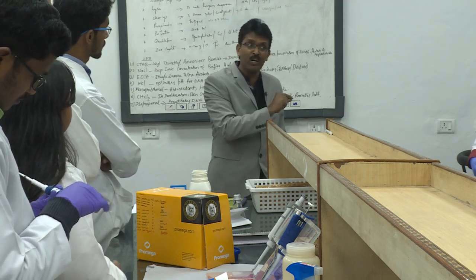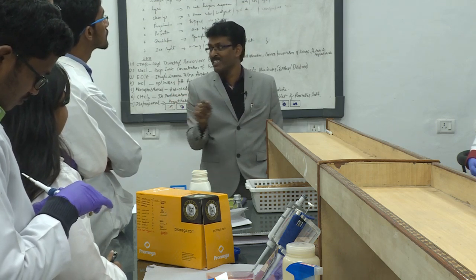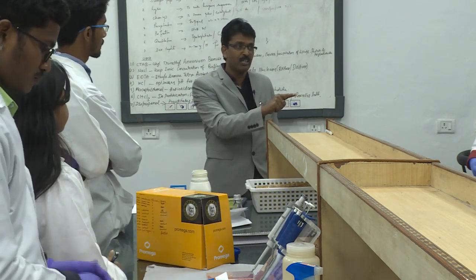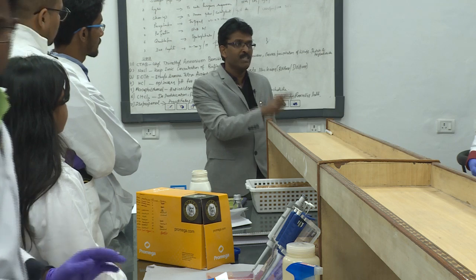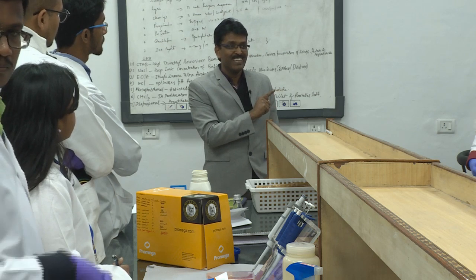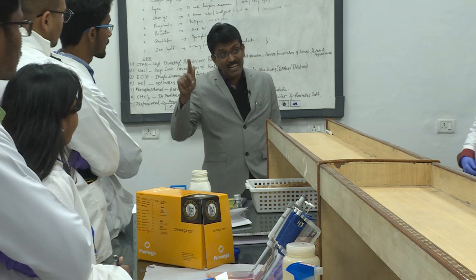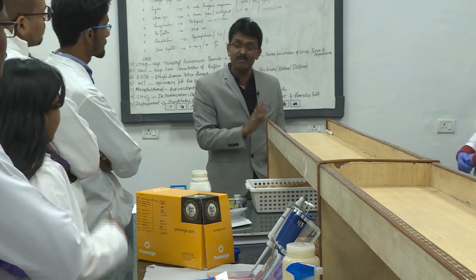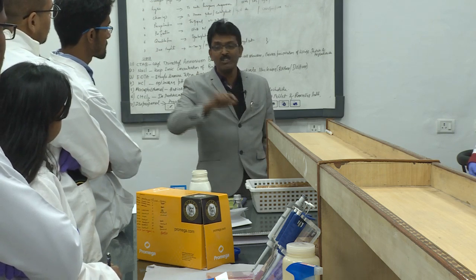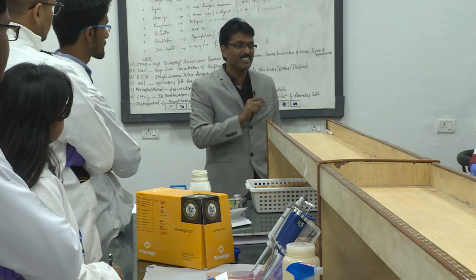Remember, it is not another colony which is preserved and you take another colony for data generation, never, right. You spot the colony, this is the Pseudomonas fluorescens colony I am going to identify. If you decided that colony needs to be preserved, a portion of that colony should be subjected to the identification effort, whatever it may be, maybe a Biolog or FAME or sequencing, a single gene or MLST or whole genome, whatever it is, the same colony is what matters, right.